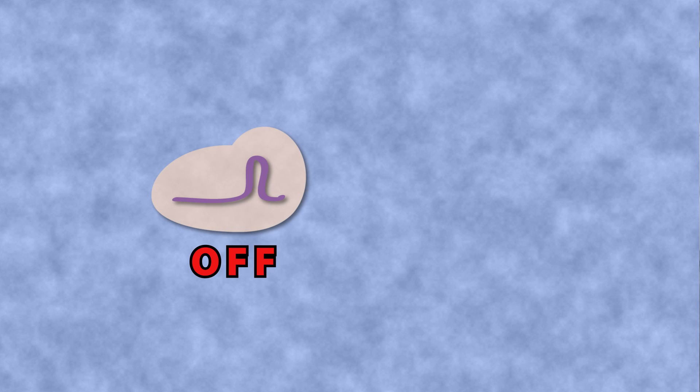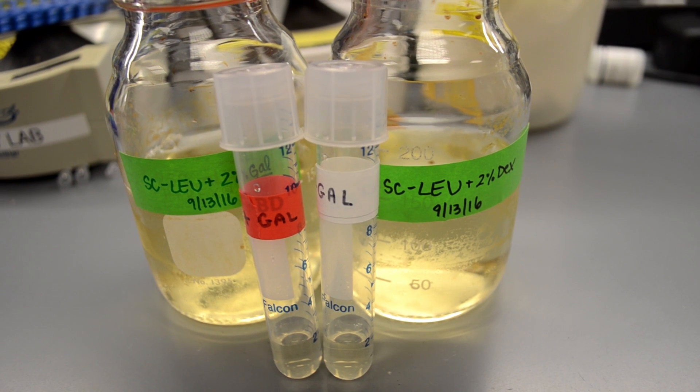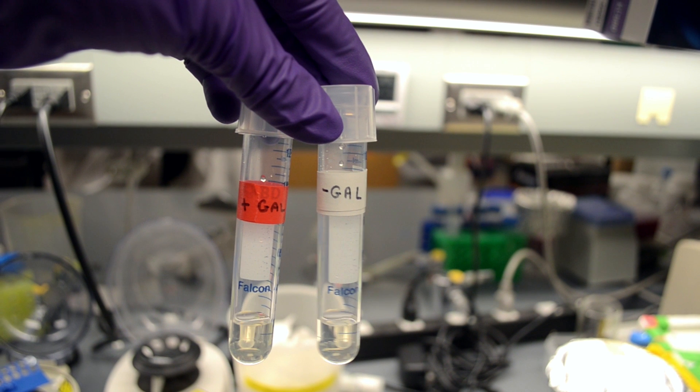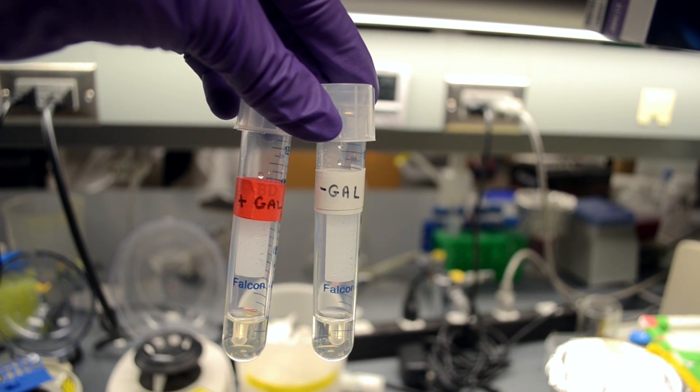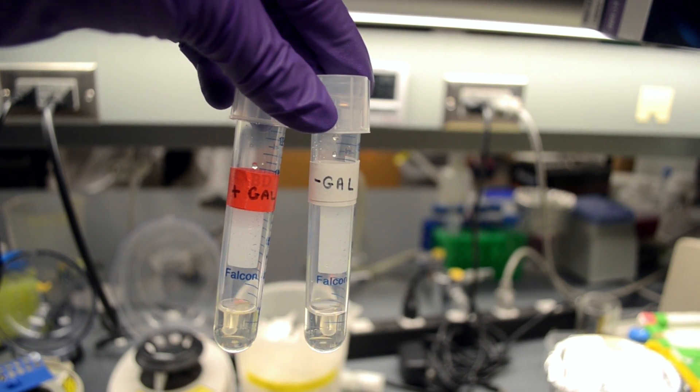In these yeast, the CRISPR system is attached to a kind of switch that can be turned on by adding a molecule called galactose, or gal. To show this in action, we'll split our yeast into two tubes. In one tube, we'll add gal to turn the CRISPR system on and cut the gene — hopefully this will create red yeast. In the other tube, we'll leave the CRISPR system off.